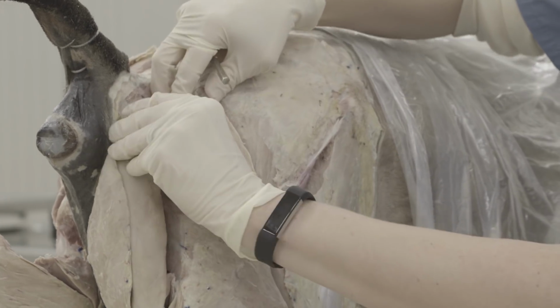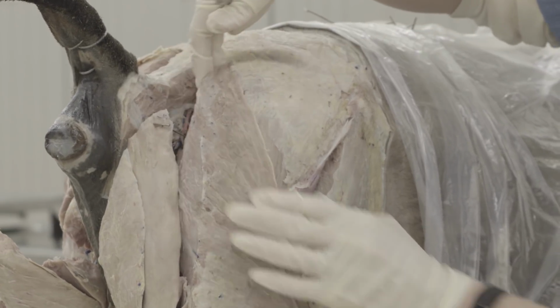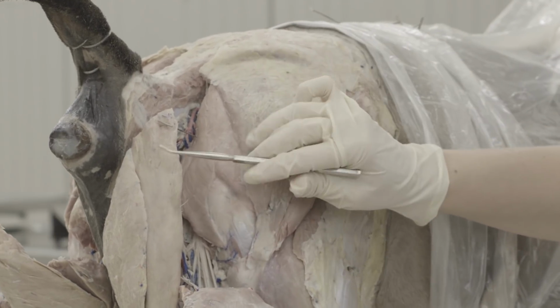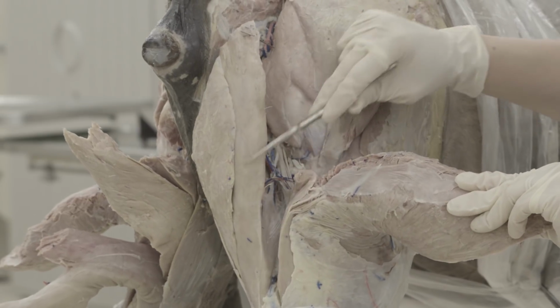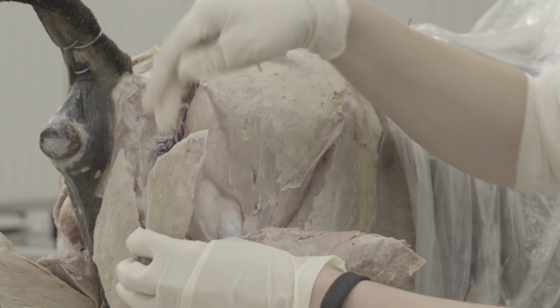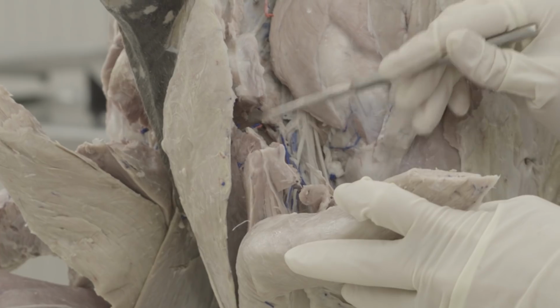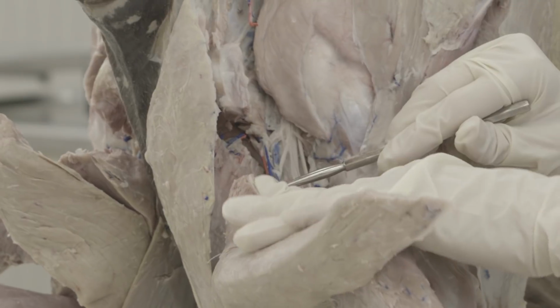So here, oops, I'm stuck to my other muscles. There we go. Biceps femoris, you'll reflect it distally. And then you'll have semitendinosus is the next muscle here. So semitendinosus, you'll also cut proximally and reflect distally. And remember, you might have those two heads that you can see that come apart there. So make sure you cut both pieces while you're reflecting distally.